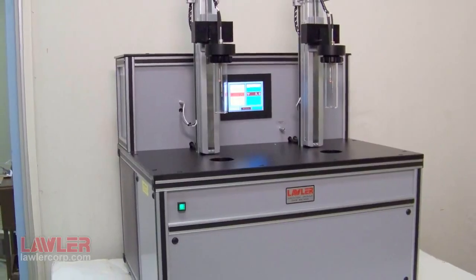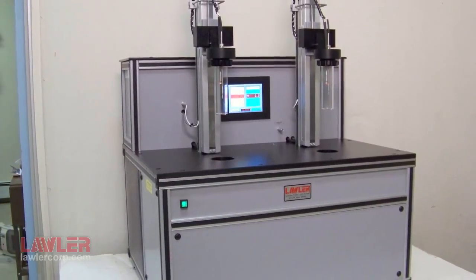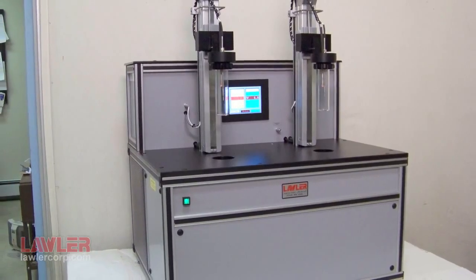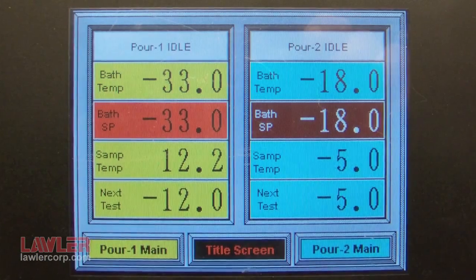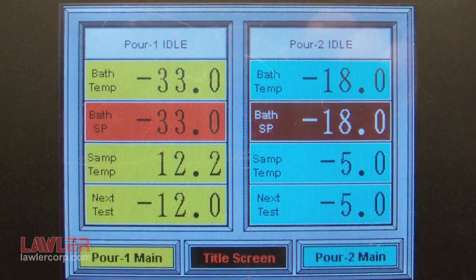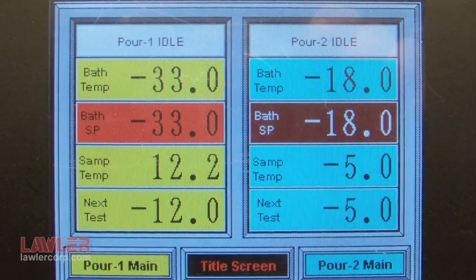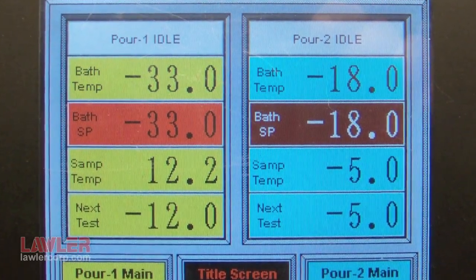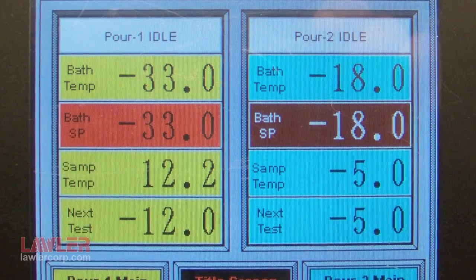Shown here is a two-position automatic pour point unit. Each test head has fully independent temperature control, robotic tilting arms, metal test jackets, and operator control. Several combinations of test method heads are available in two position units.